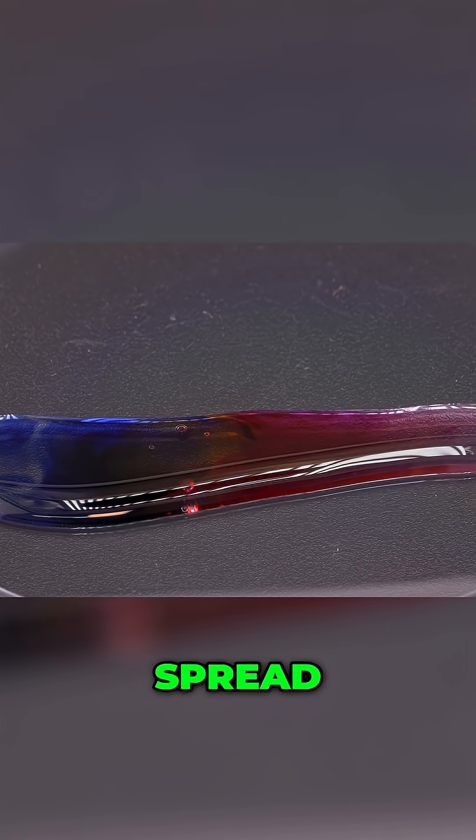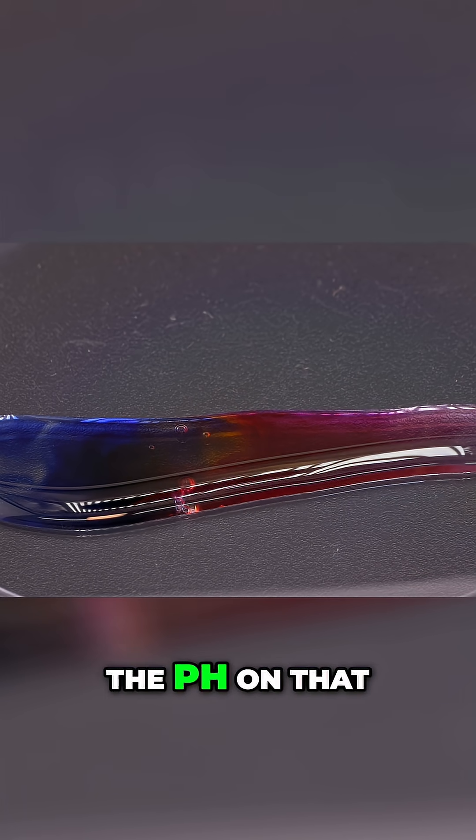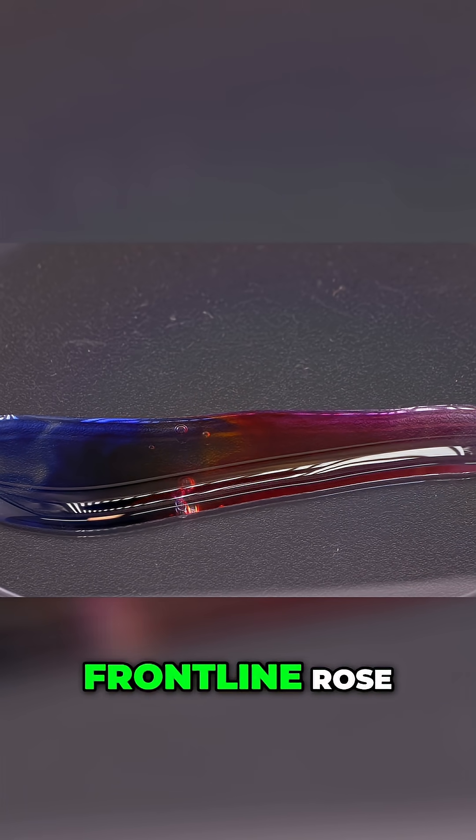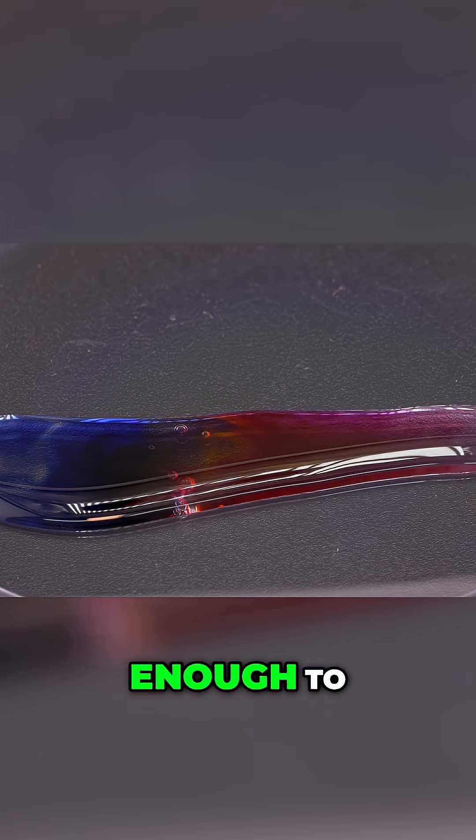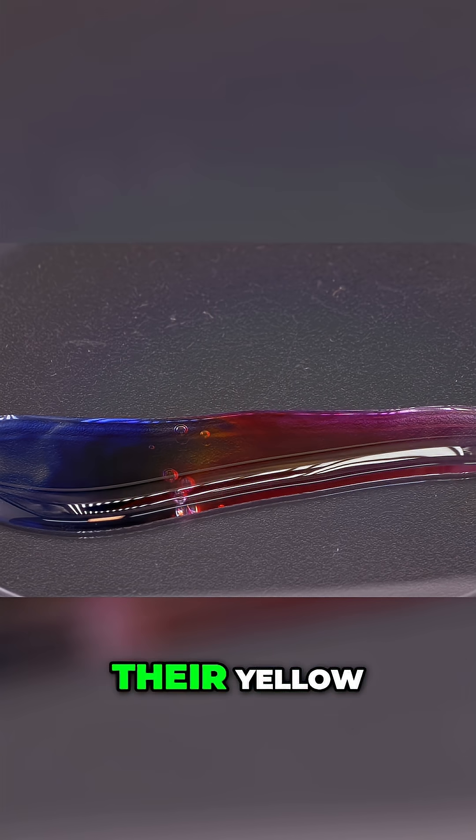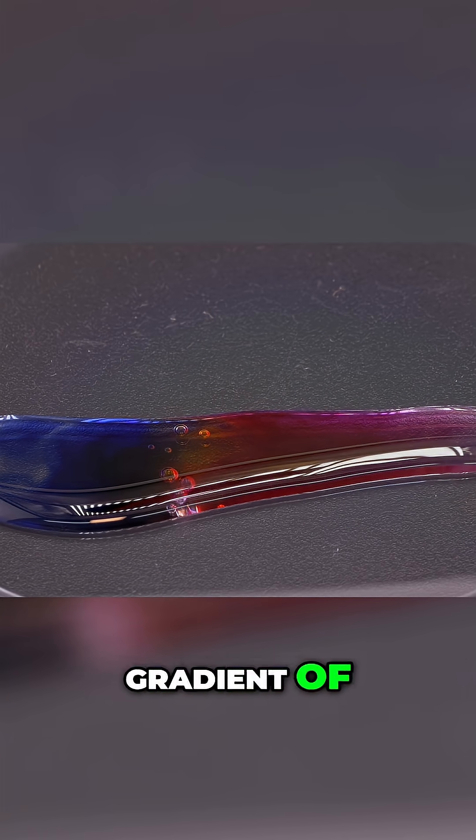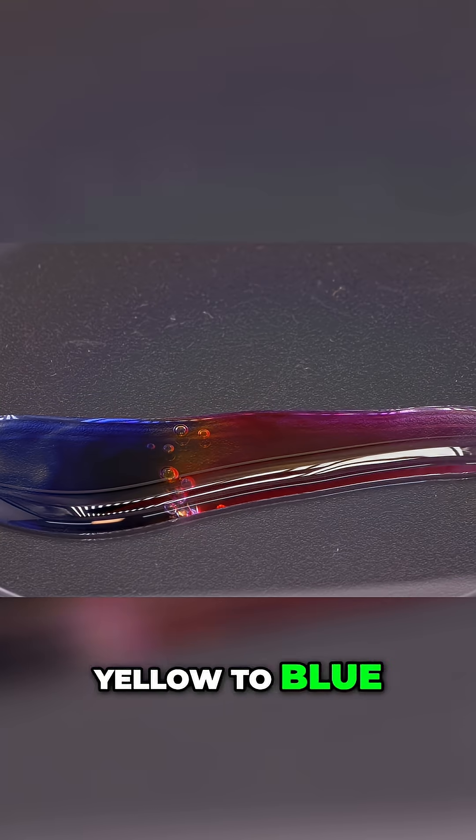As the acid spread out and was weakened by the surrounding blue base, the pH on that expanding front line rose just enough to make the indicator molecules shift into their yellow shape. The result is that incredible gradient of color. Red to orange to yellow to blue. All in one dish.